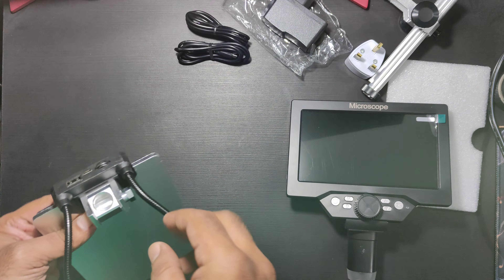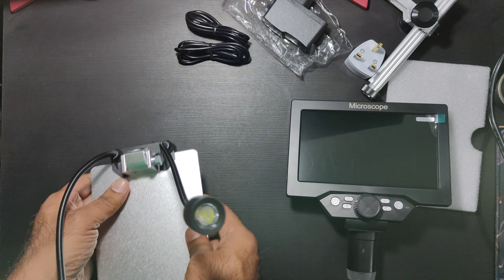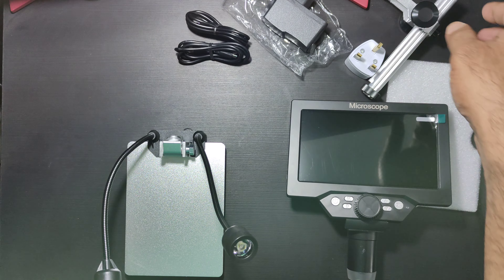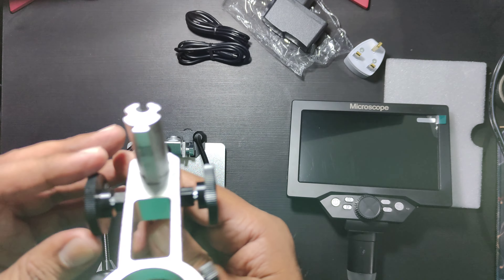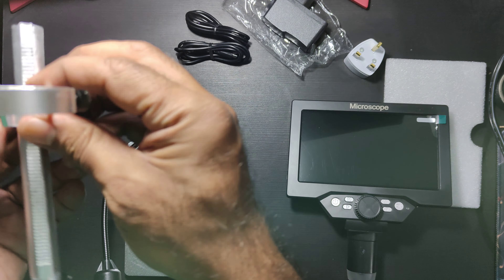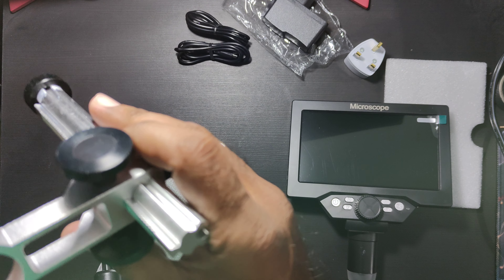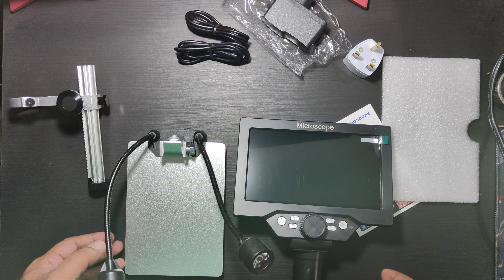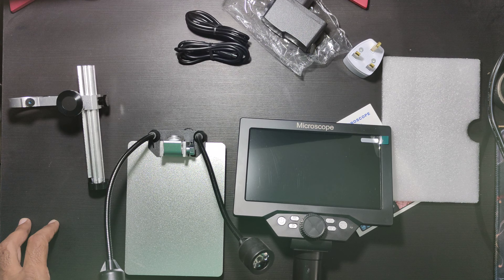This is for taking out the USB power and connecting to this. Now for the main unit — this is nothing but just a packaging. This is essentially an advanced version of a USB microscope attached to a screen, and the connectivity is all internal.